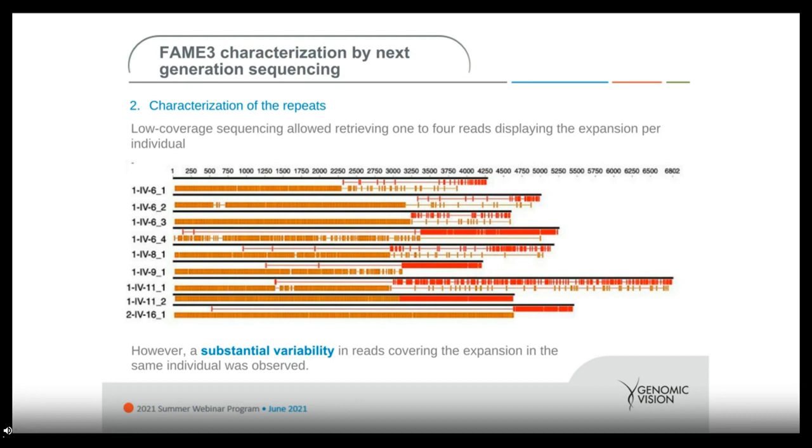You can see from the map where, in yellow, within different patients, are the intronic sequences that are normally present, and in red is the expansion, but it cannot be measured precisely because there is some gap of the sequencing between all these expansions. So in this case, the sequencing could not give a precise overview of the onset of the disease.